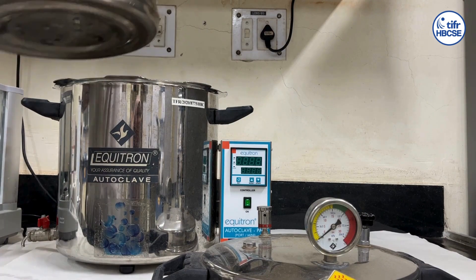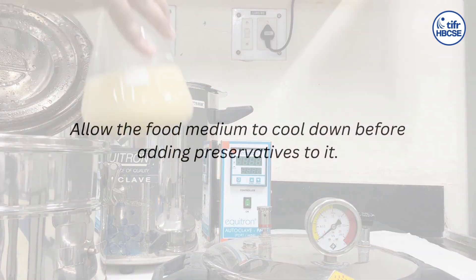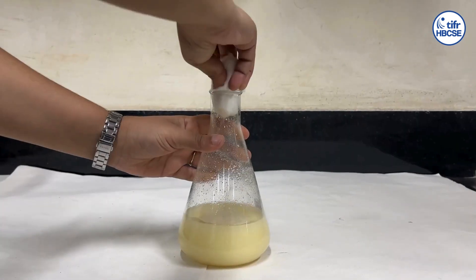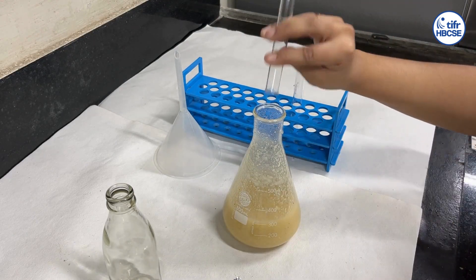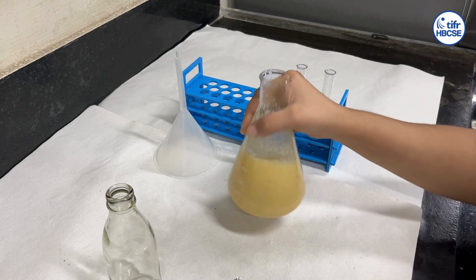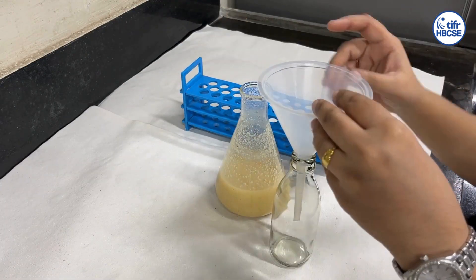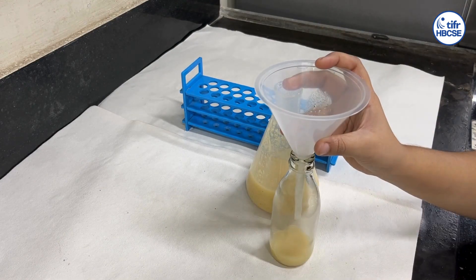After the autoclave cycle is complete, remove the media flask from the autoclave and allow the food medium to cool down slightly. Then add the preservative mixtures into the flask and shake well. Pour approximately 15 ml of food medium into a sterilized culture bottle using a funnel.